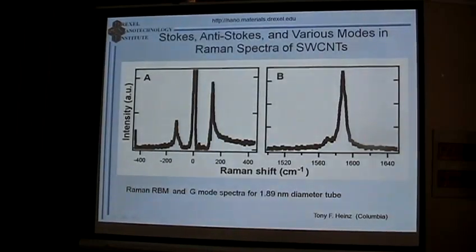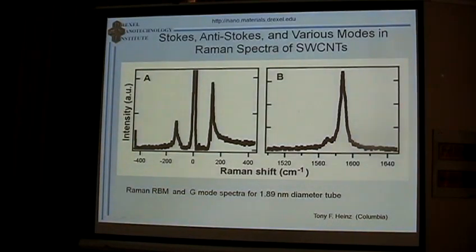Pay attention to the fact that when you read literature, you may find that people present Raman spectra in both ways. Traditionally, spectroscopically, going from large wave numbers to smaller wave numbers, or, as it is becoming more and more common in Raman spectroscopy now, going from 0 to higher wave number, showing Raman shift.